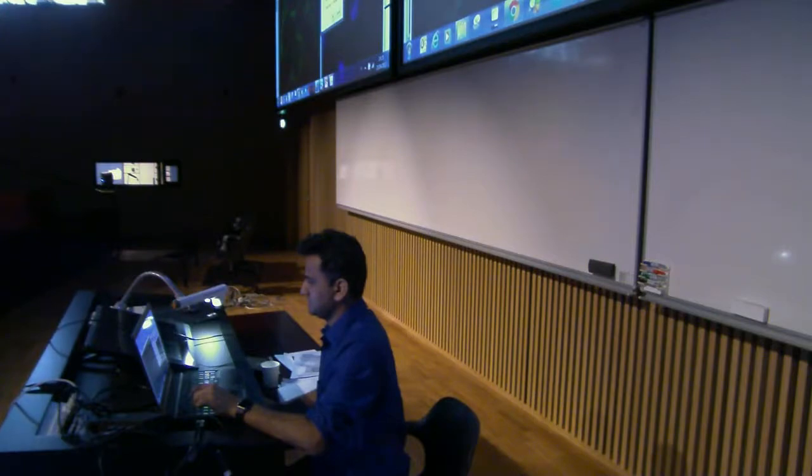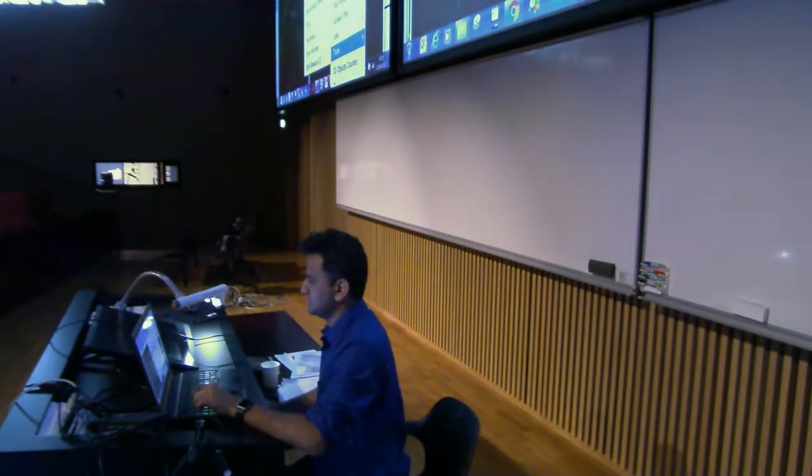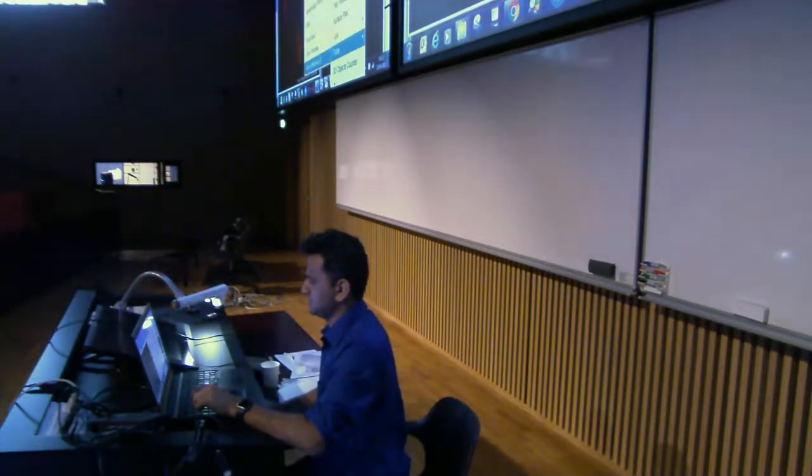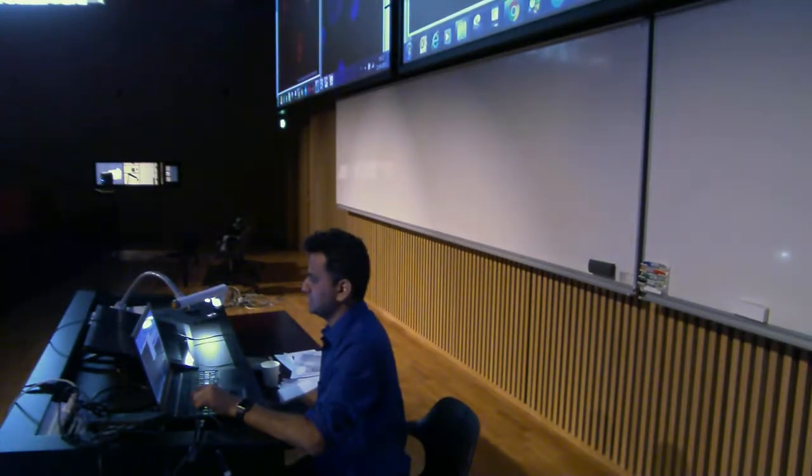This one, Analyze, Tools, Scale Bar, but not green, but the blue. This one, Tools, Scale Bar, becomes red.